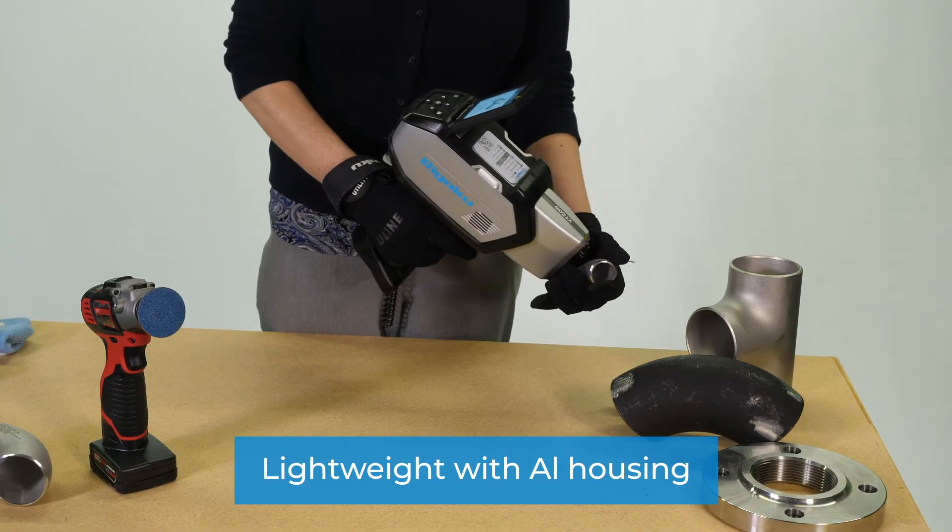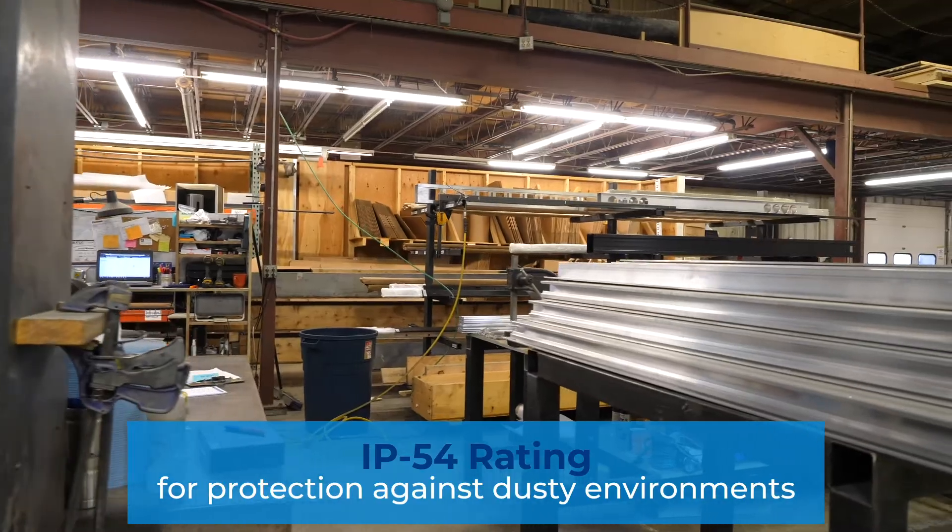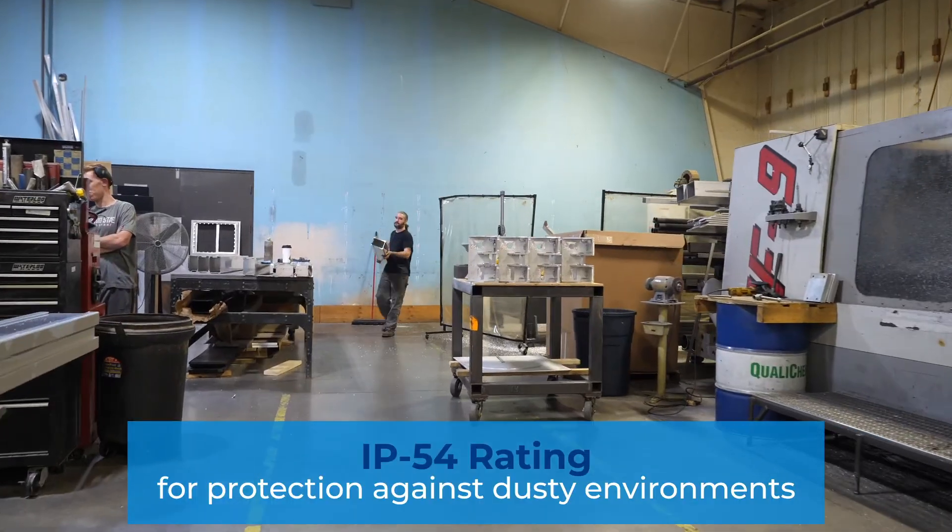Lightweight with aluminum housing — less fatigue, lower use cycle, better heat dissipation. IP54 rating for protection against dusty environments to withstand the environment you work in.